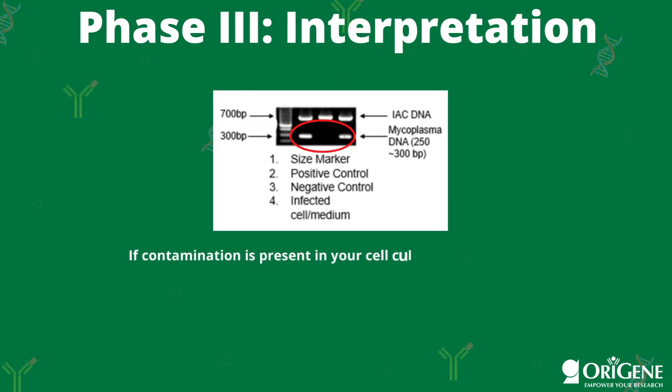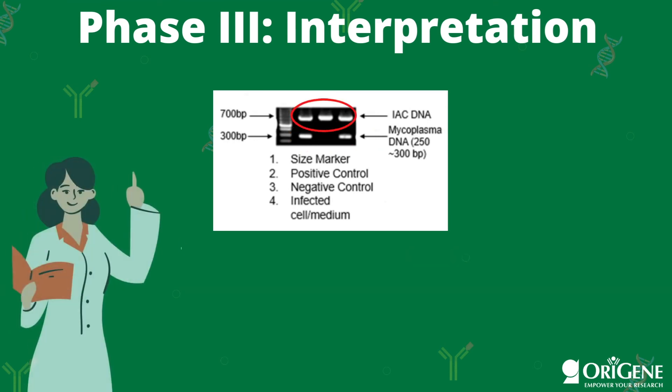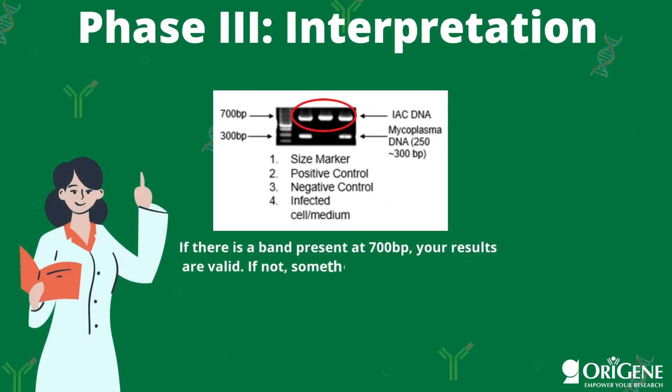We will now wrap everything up with phase 3, result interpretation. When mycoplasma contamination is present in your cell culture, you will see a band around 250 to 300 base pairs. In addition, there should be a band present at 700 base pairs — this is the internal amplification control. If this band is not present in one of your lanes, something went wrong during the PCR step, and you should retest your culture.